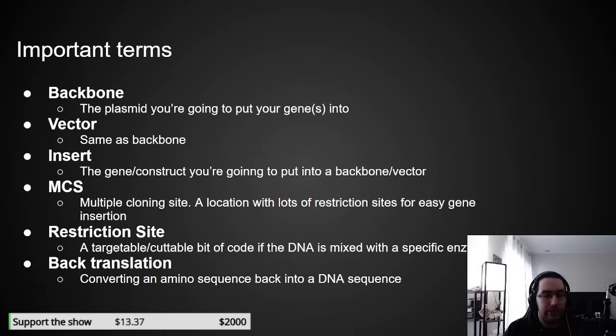And you'll see what this looks like in a second, but this is what a restriction site is and a restriction enzyme. They're sort of the bread and butter of your basic DNA handling. There are different ways to handle DNA, but knowing how restriction sites and restriction enzymes work is super important. Because also just for DNA analysis, you can use restriction enzymes.